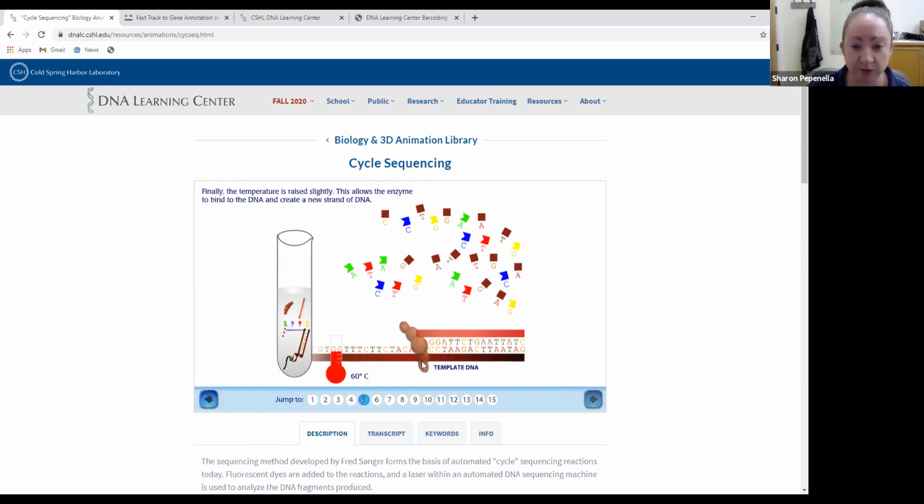Now, what the polymerase will do is randomly grab nucleotides from this pool of dNTPs and ddNTPs to incorporate into our growing chain. Now, when I say random, it means it can't differentiate between a dNTP or a ddNTP, but of course, it still has to pull in a complementary nucleotide to the base that's in the DNA chain. So it's going to start to bring in these nucleotides. So you can see it's bringing in a T here, a G, a T, and it's creating this strand here until it pulls in one of those dideoxynucleotides, in this case, a ddATP.